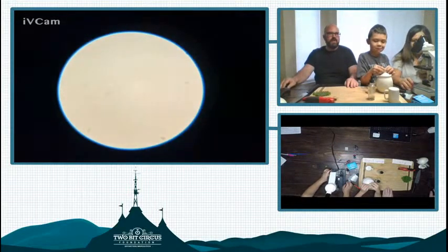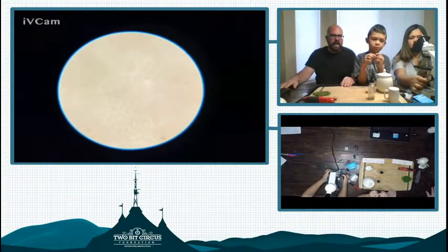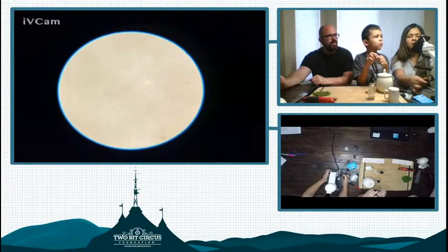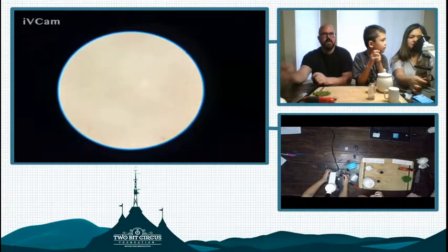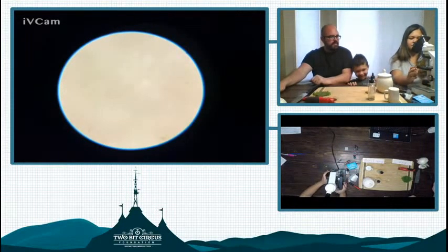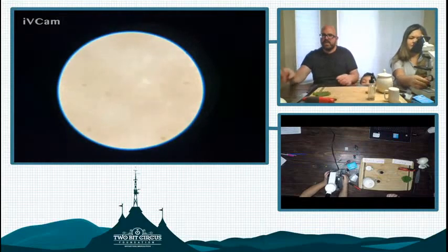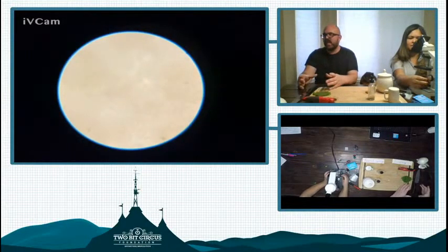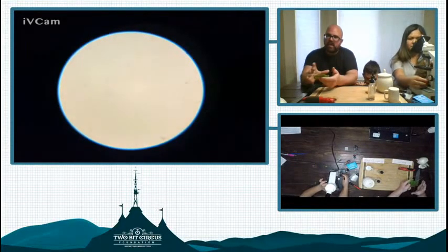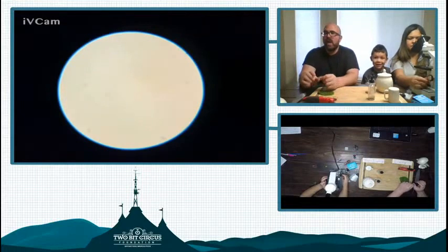So anybody who's watching this who really wants to do the work that we're doing and even do additional experiments with other things you could find around your house, you can get a microscope off the internet or in the stores. I think most stores sell a basic kit, like in the toy section. Those toy microscopes can work as long as you can get light to come through the slide. Right? And then they also have stereo microscopes, which are a little different, which shine light from the top surface, and that allows you to look at objects like a leaf and not necessarily see the cells, but see a closer zoomed-in look of the structure. That's really helpful for objects that are not transparent.